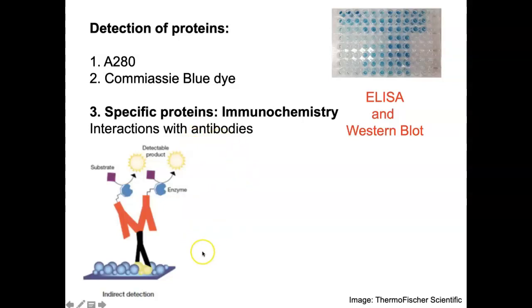So in Western blot, you start out with your protein that was separated by size, immobilized on the membrane, and then usually there are other proteins around, and the first step is usually to block non-specific binding.